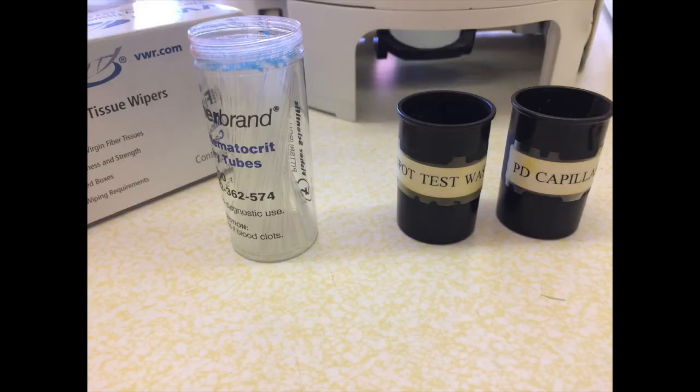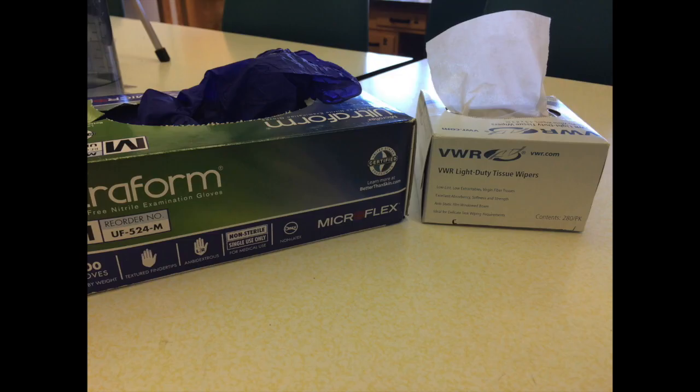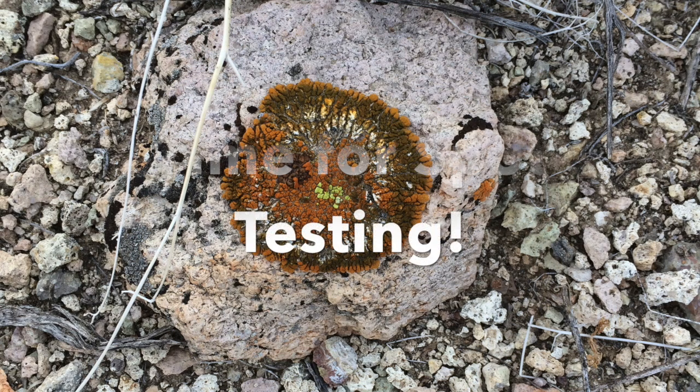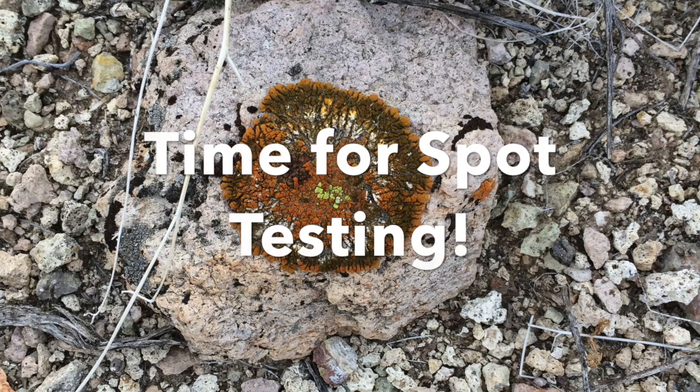Glass capillaries are required for P testing, and it is always a good idea to have separate waste containers for your spot test waste. Lastly, tissue wipes and gloves are great for keeping your workspace clean and reducing any unwanted exposure to any of the chemical reagents. Now that all the basics are covered, let's see some spot testing in action.